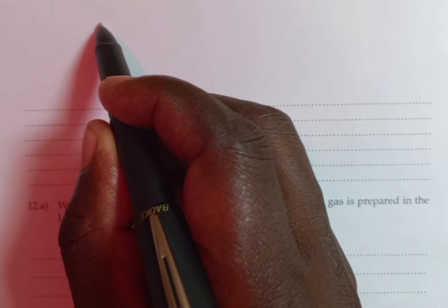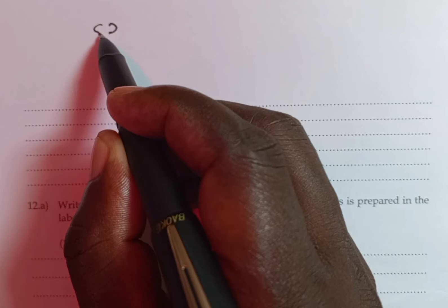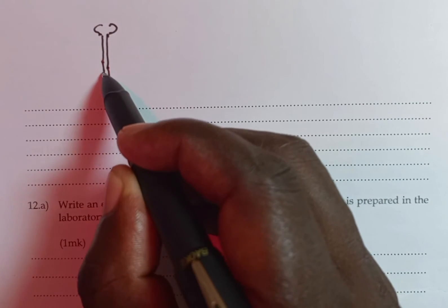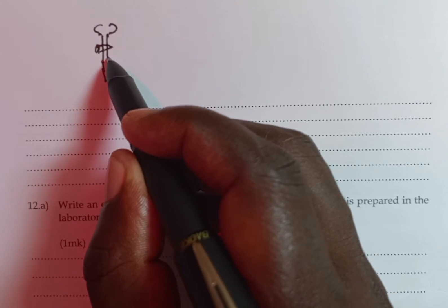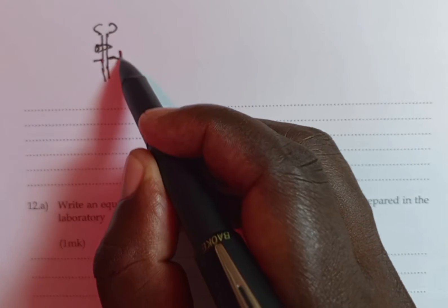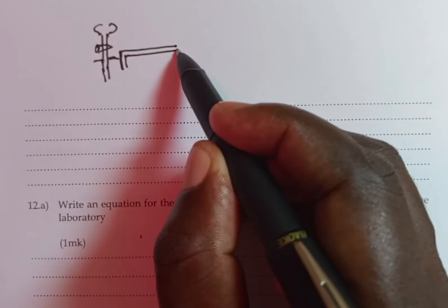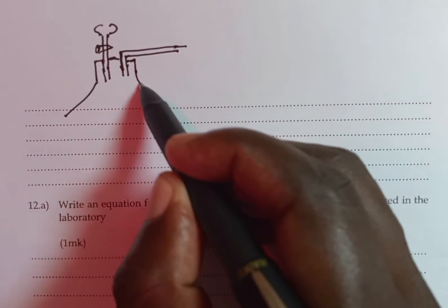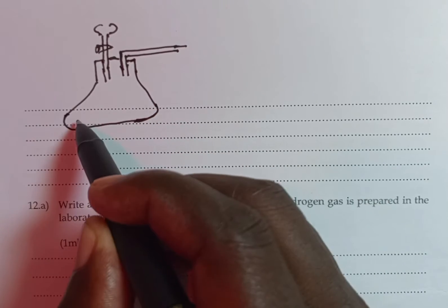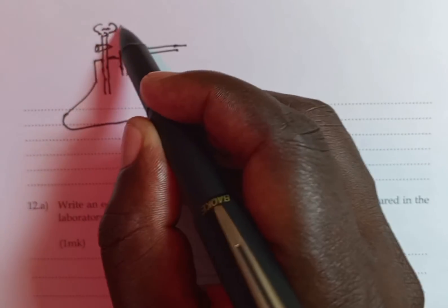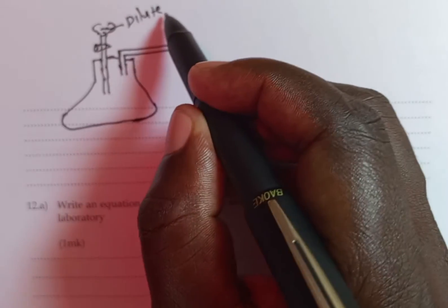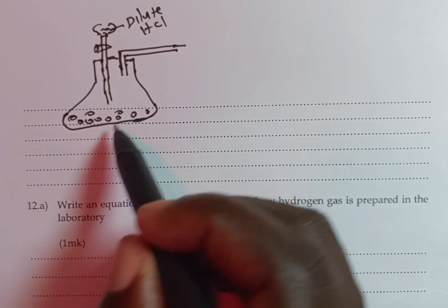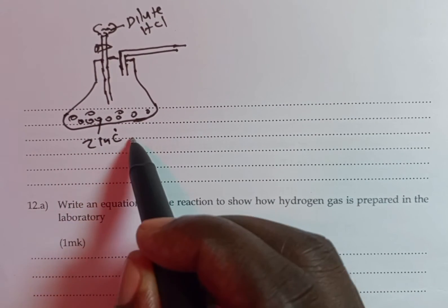The diagram for the laboratory preparation of hydrogen gas looks like this. This is the dropping funnel with a tap here. This is our delivery tube. This is our reaction chamber where we have the dilute hydrochloric acid. We have zinc metal here, zinc metal or zinc granules.